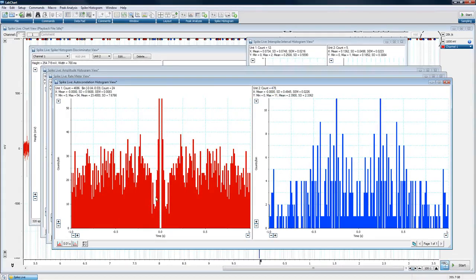You can see that in Unit 1. We have a pretty clear understanding, again, of my doublet firing. So we have a firing at 0, and then really close to the other ones we have a firing next to it. And then we also have another lull after that doublet. So we gain information from this just by using the histogram.